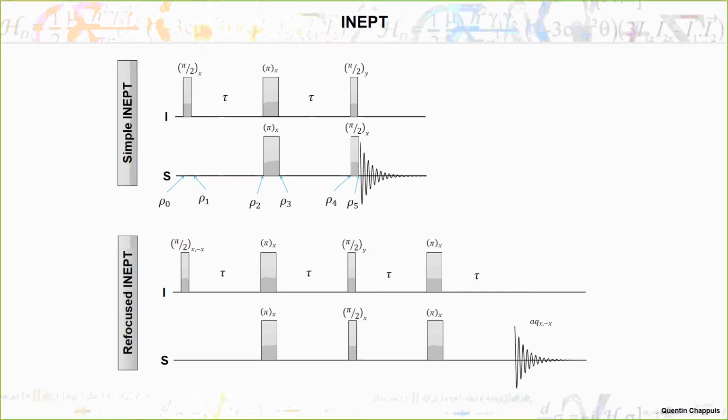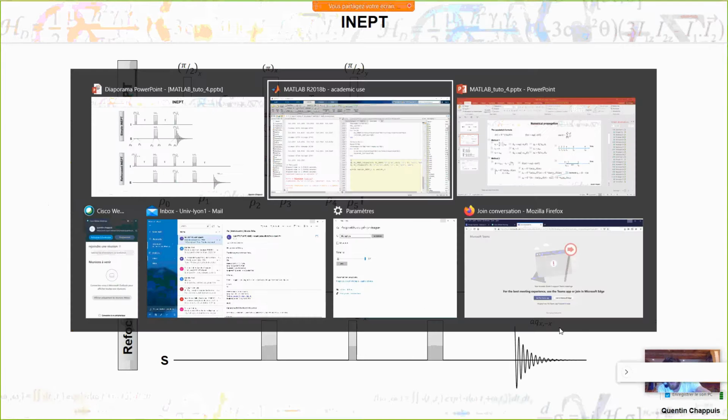I just took this one because I could find a phase cycling that is easy to apply, and it will give a nice result. We just add one echo here, so it will be very short to just add this in our pulse sequence. And then here I have written the two-step phase cycle. The first one is along X, and acquisition along X, and then the second one is minus X, minus X. So let's have a look at this.